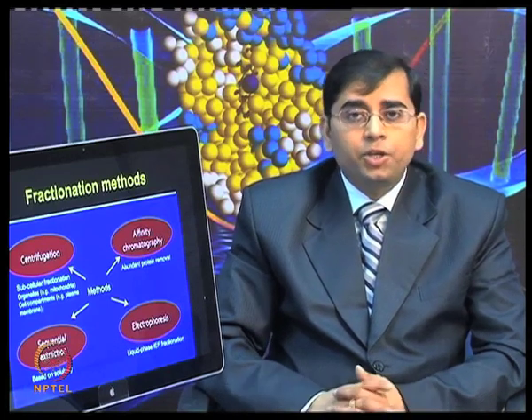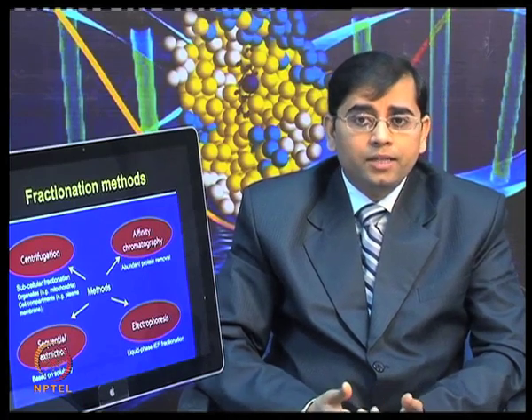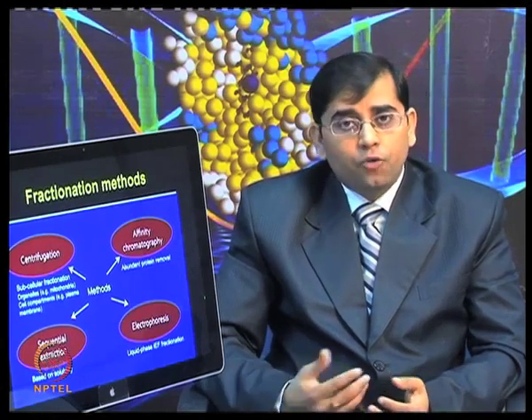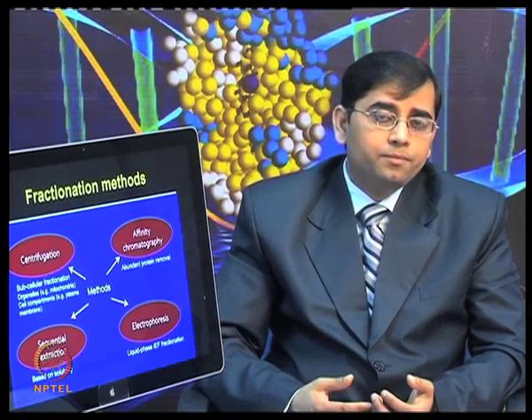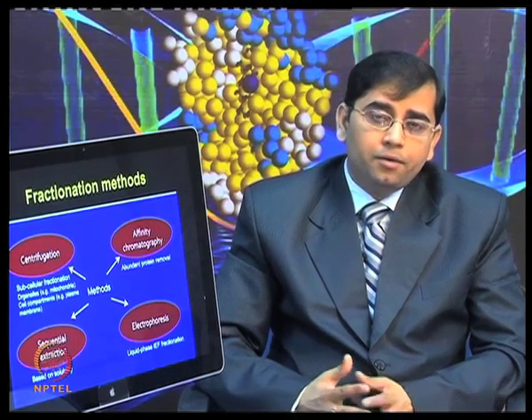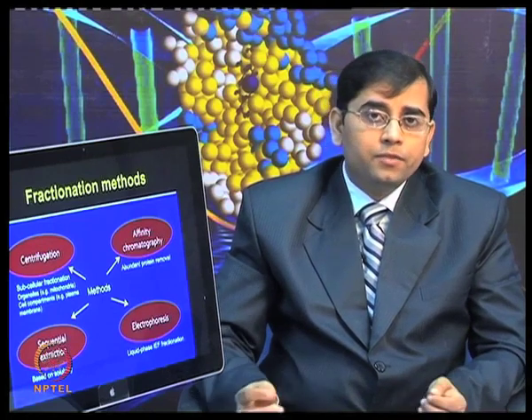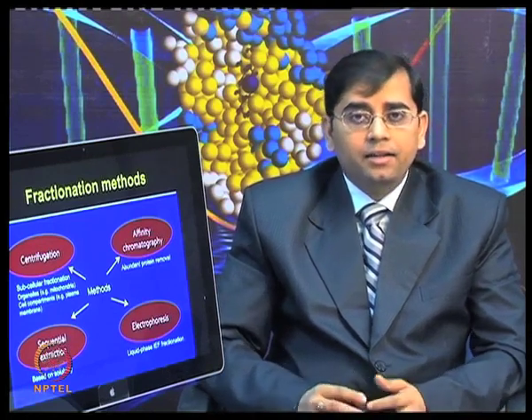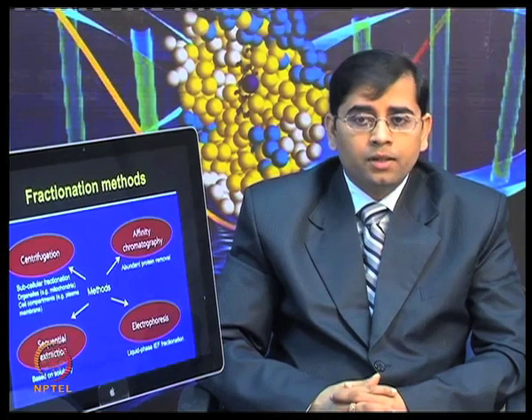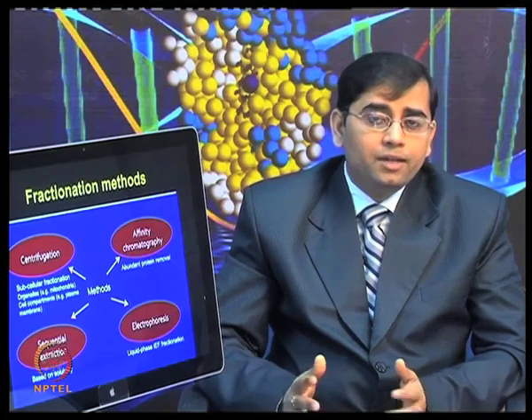Electrophoresis can be used for fractionation. For example, if you are using a gel-free method, where you directly want to extract the protein and analyze it using mass spectrometry, rather than applying the whole sample directly to liquid chromatography, one can first simplify the proteome by using isoelectric focusing, doing the IEF process in the liquid phase itself. Liquid phase IEF fractionation can simplify the proteome based on the isoelectric point.